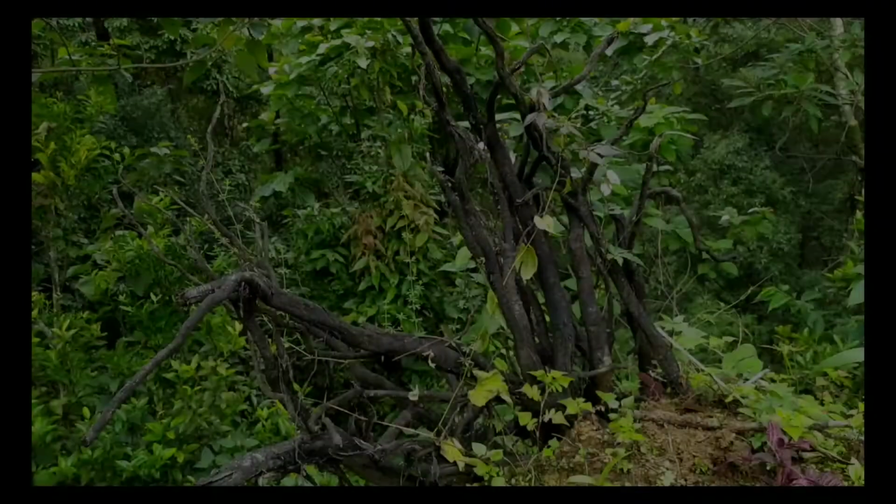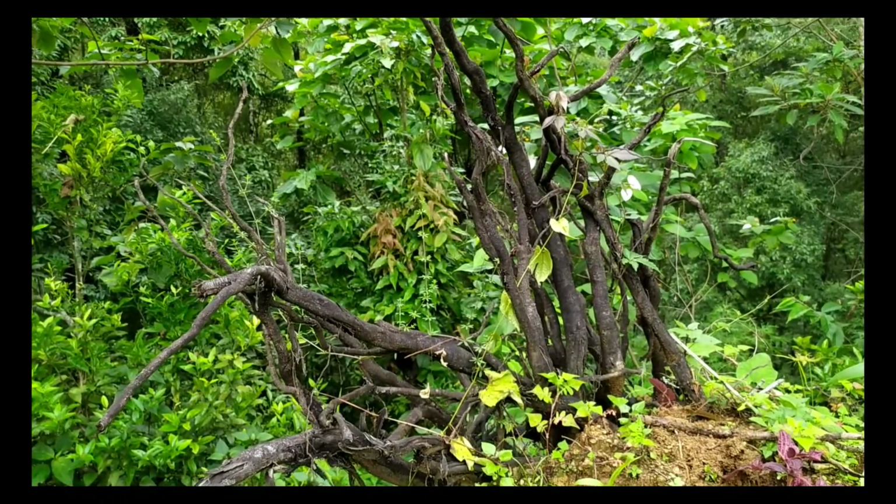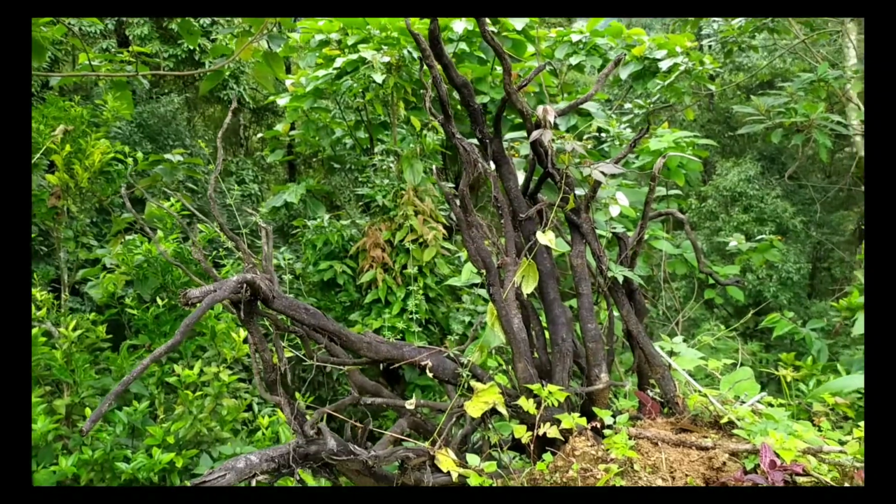And in today's episode of ARS Biologicals, you must have seen the topic: how rotten wood looks under the microscope. So in this video we are going to observe rotten wood collected from a nearby forest site under the microscope. So let's get started. This kind of wood you can also use, but I'm searching for a good one.